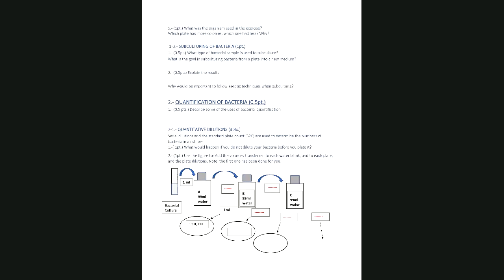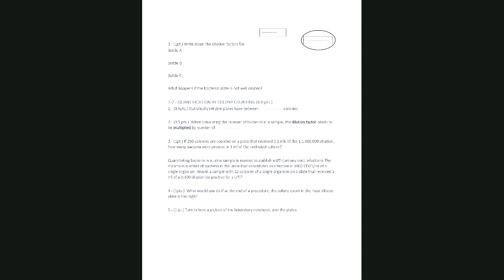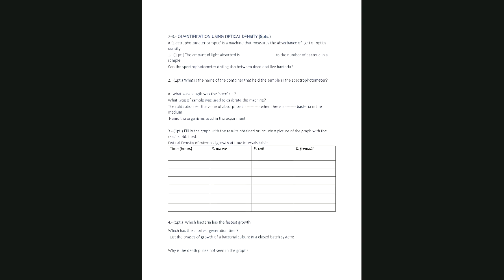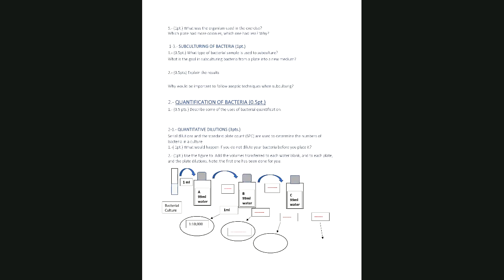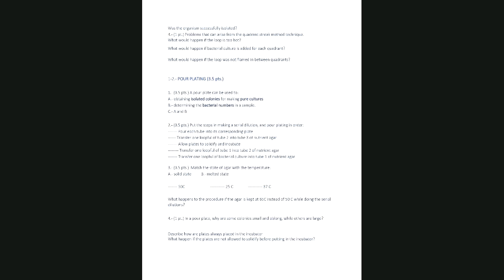Okay, so culture of bacteria, quantification of bacteria. Let me just refresh my memory here real quick. Okay, perfect. All right, so let's go for quantification of bacteria. Pour plates. Is that how we're going to do it?